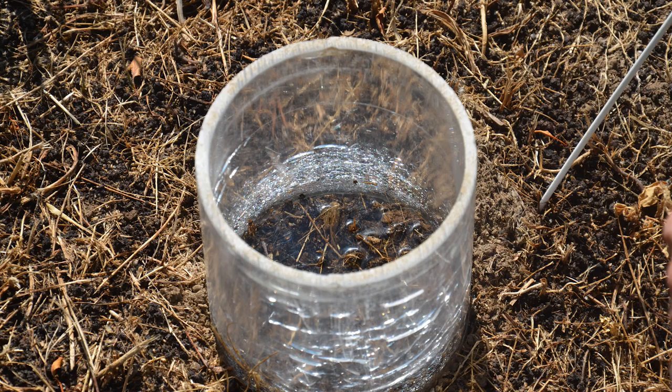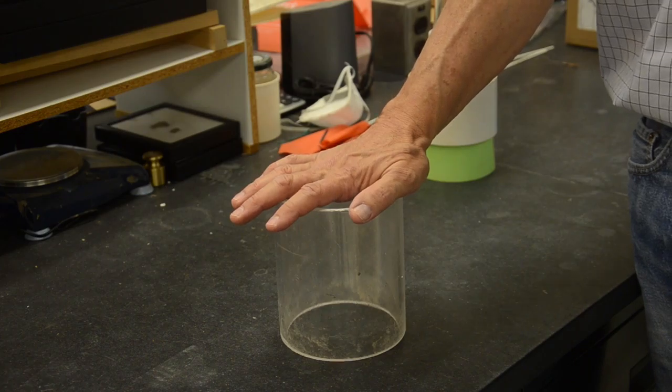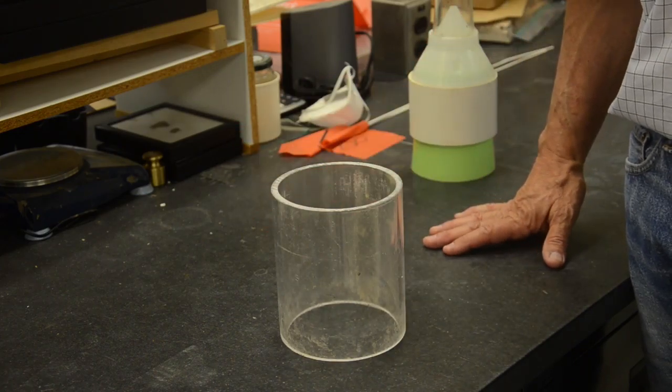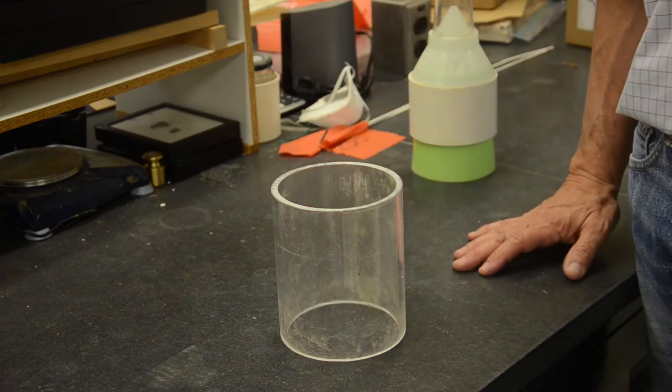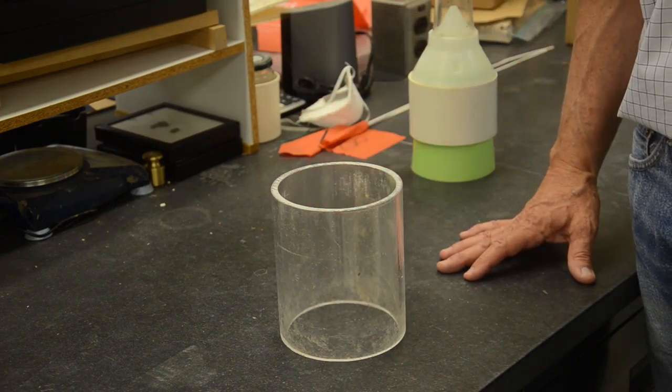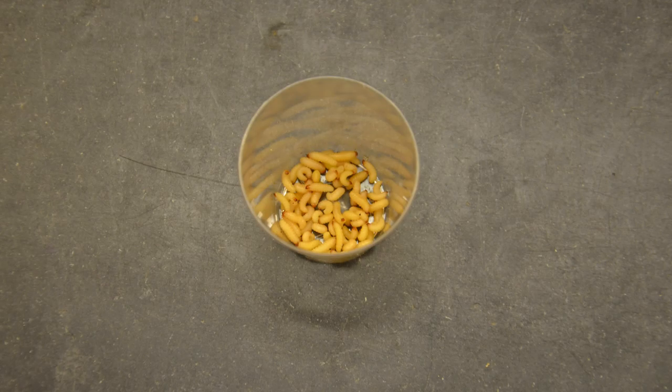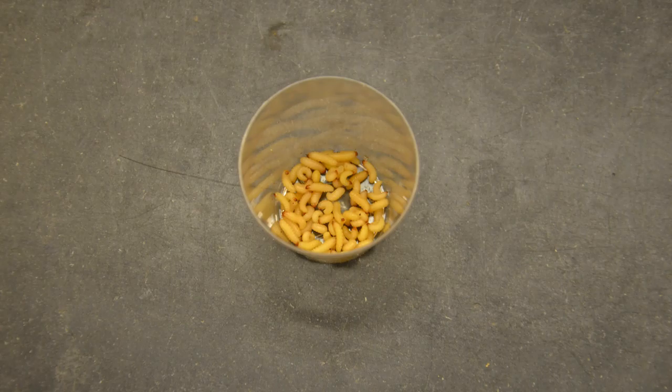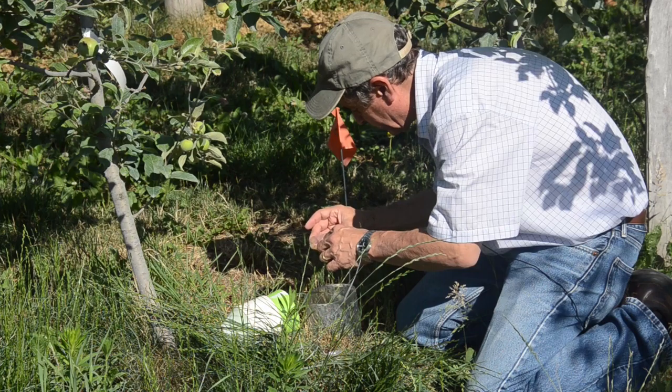We do this in sites where the orchard has been inoculated with nematodes, so there should be some already present in the soil, and other places where it has not been treated - the controls. What we do is I collect Plum Curculio larvae from the colony and I drop 10, just to get a good even number, into each arena.